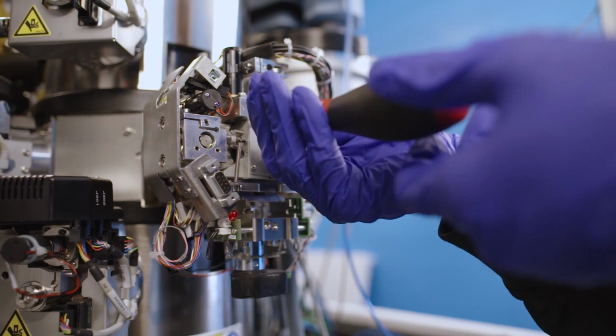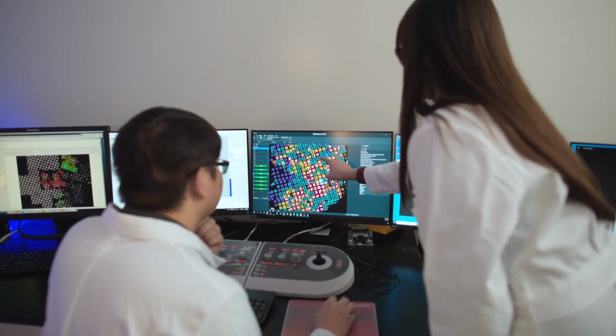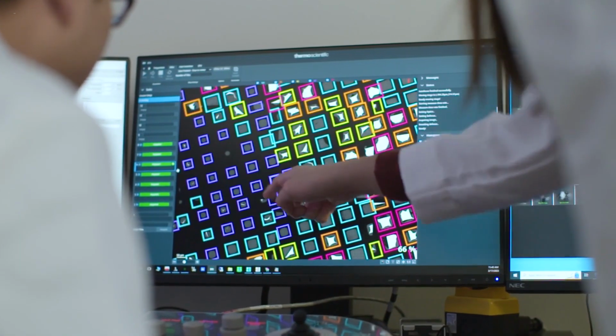The wonderful part about structural biology, and it's almost an endorphin release, is the discovery of what was previously unknown. And so every time I've seen a structure of my proteins, whether or not it's by X-ray crystallography, but most excitingly cryo-EM, because you can see so many different shapes, there's just a thrill that runs through my body. And that's an addiction that keeps me up at night.